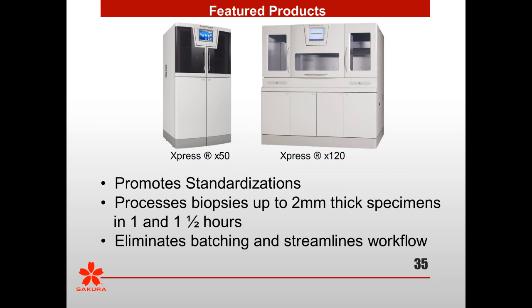Thank you, Bill. Once adequately fixed, can all tissue samples, routine and biopsies, be processed in 1 or 1.5 hours? That's an easy one, if cut at 2 millimeters. I can tell you, if you're 2 millimeters or less, you can process on what I have available to me in the standardized protocol. We typically do most of our resection tissues in the extended protocol, because much as we try to demand compliance, I do get some variation from PA to PA on their resection samples.